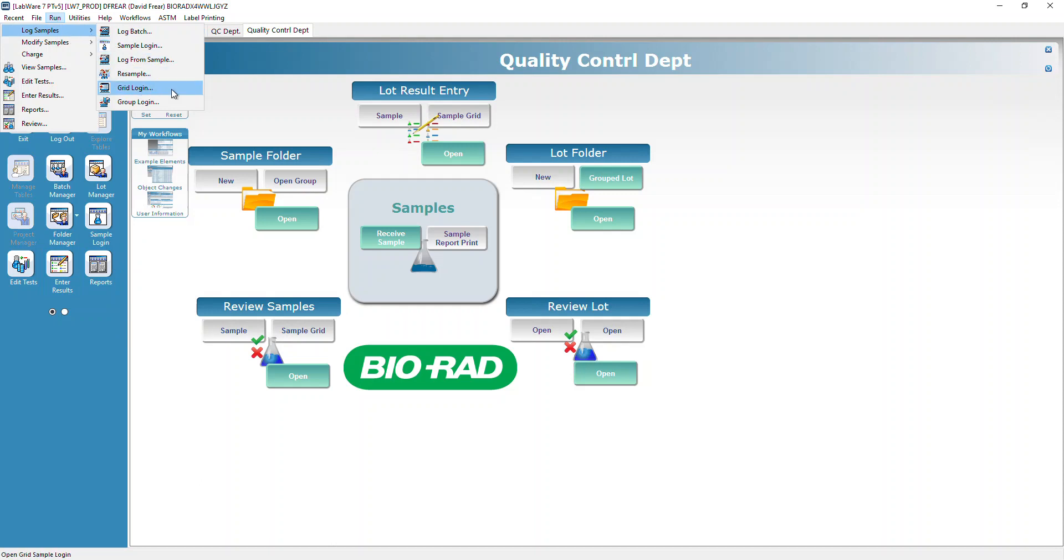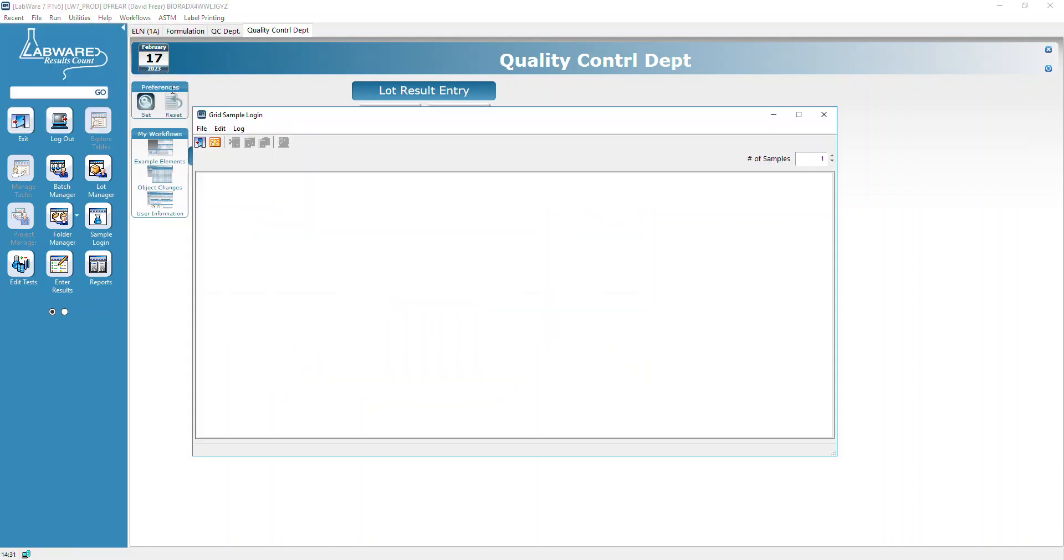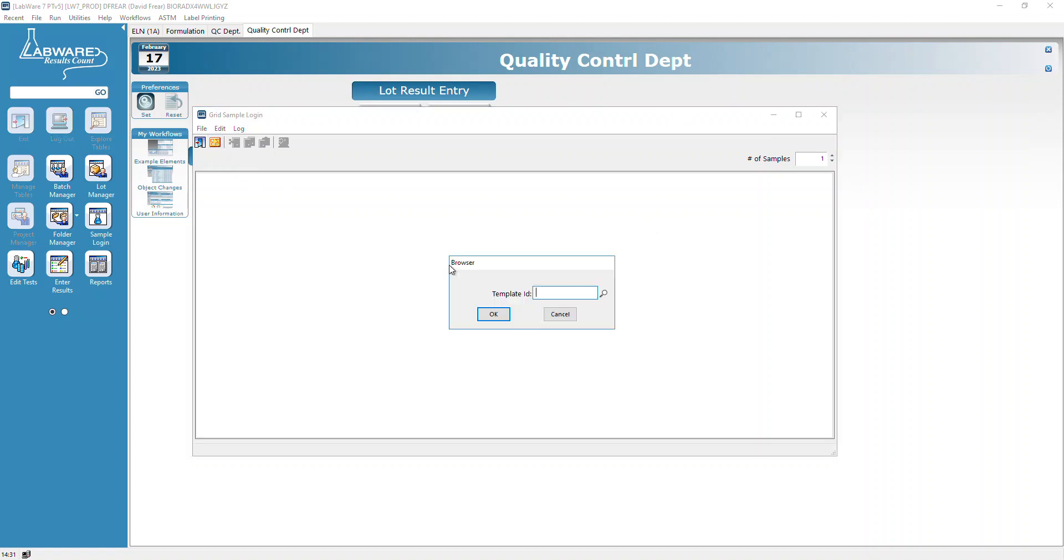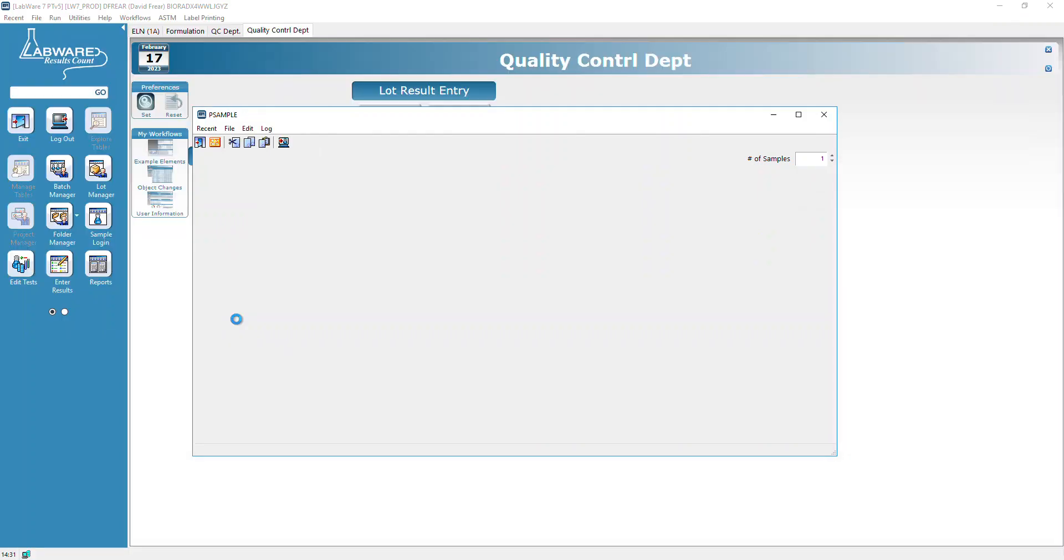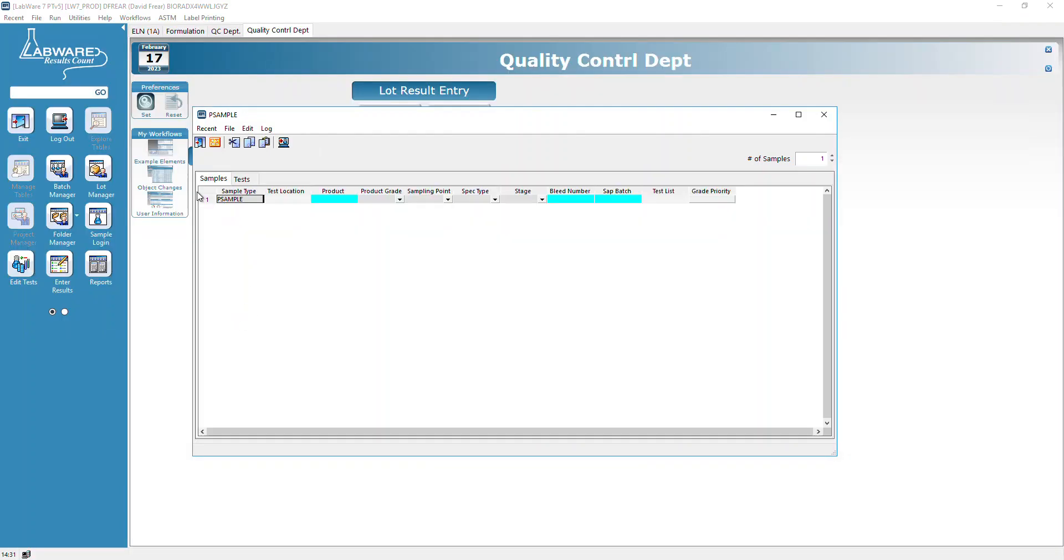Once you get to this screen, we can select a template using this waffle. We're going to select the P sample login template and click OK.